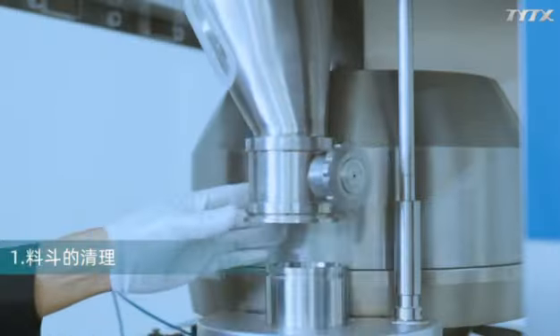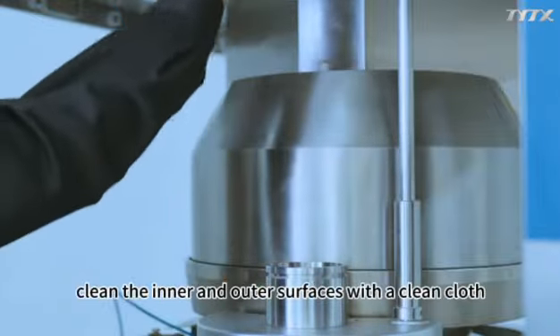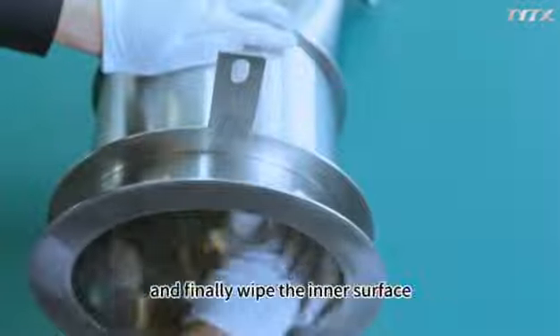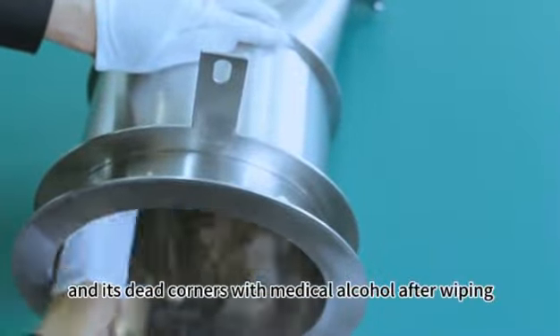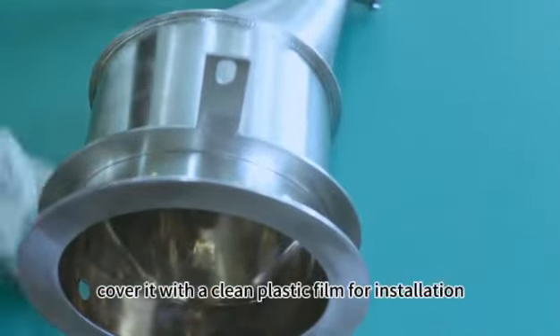Cleaning the hopper. First, remove the bottom hopper at the top of the machine. Clean the inner and outer surfaces with a clean cloth, and finally wipe the inner surface and its dead corners with medical alcohol. After wiping, cover it with a clean plastic film for installation.